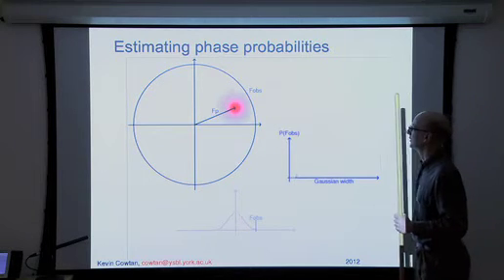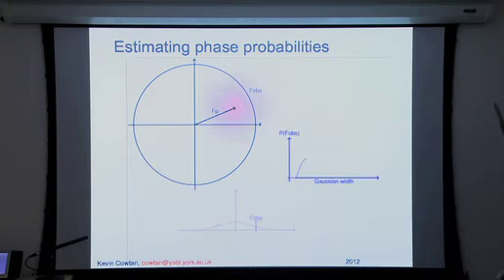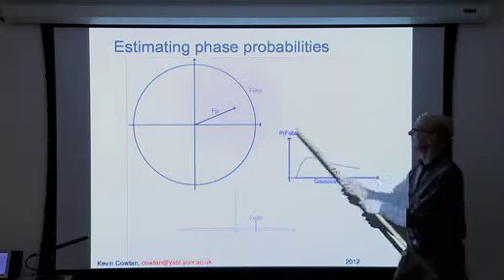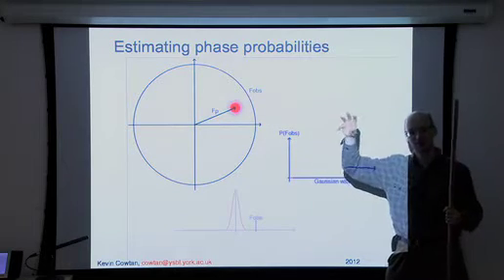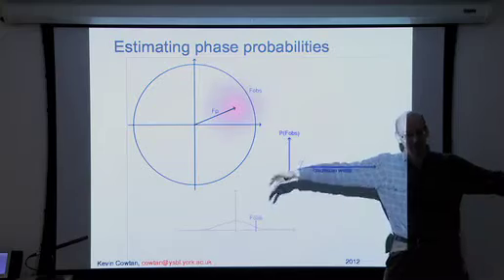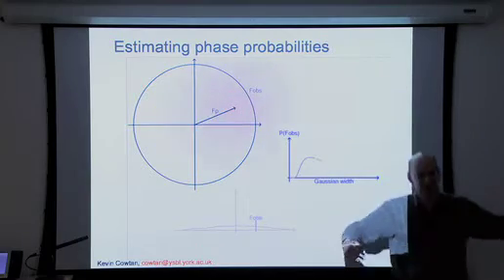There is a slight point that confused me for a while. You would have thought that you can always fit the observations better by simply introducing a bigger error term. That's what this little animation is about. It shows that because the probabilities add up to 1, as you increase your error term, your Gaussian gets wider and the top gets lower.